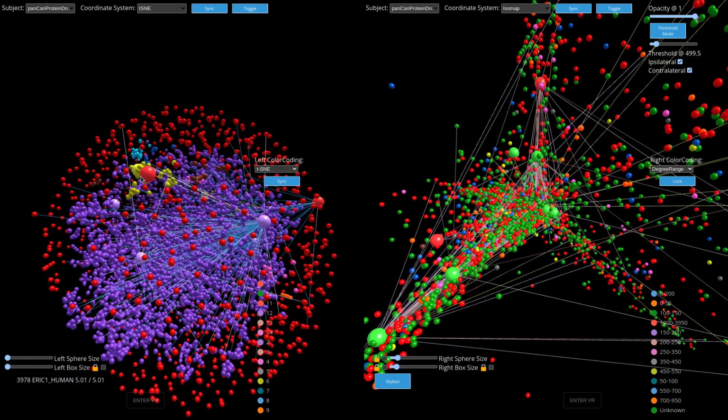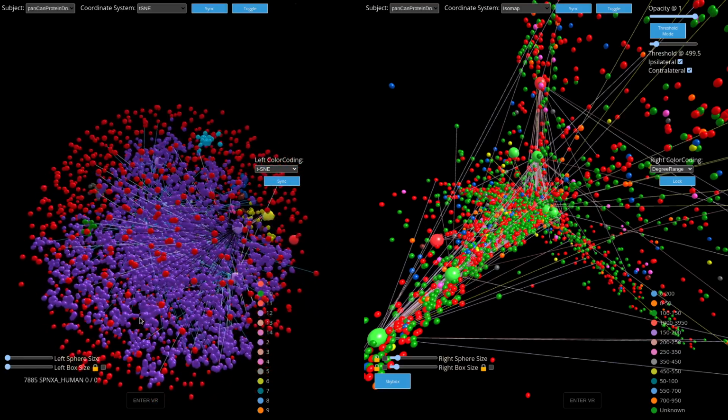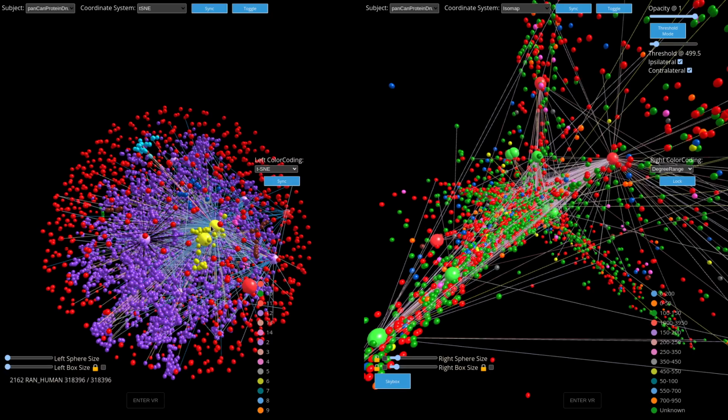Those yellow spots can be inspected. You can see which genes those are. So you can do some gene or protein of interest discovery on those. You can click on one of these. So that one was clicked. Now it's unclicked. And you can see its network. Some of them have a high degree. Others have not so high degree.